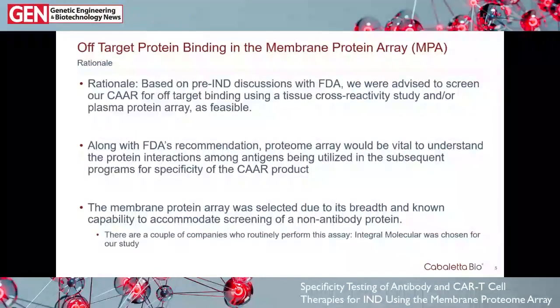Before we could finalize our lead CAAR candidate, we needed to conduct an off-target binding analysis. Since most of the CARs that are used in the clinic right now use an antibody fragment, the intrinsic risk of off-target binding is low due to the specificity of scFvs. However, in our case, we were working with 2 distinct proteins, and they could have multiple binding partners, binding domains, and it would be important for us to see if there is off-target binding happening.